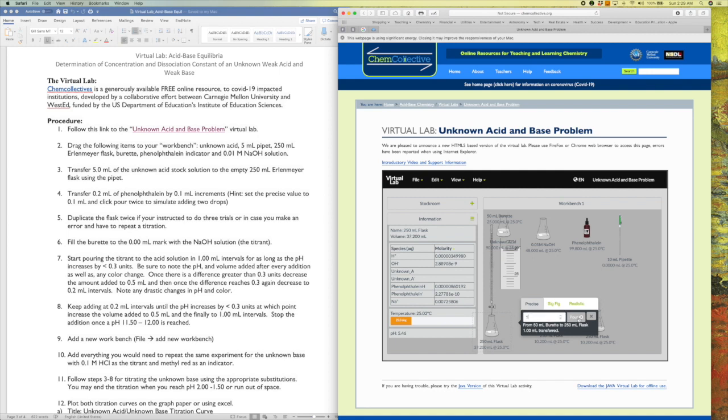Still going up by about 0.05. Okay. We're still going up by 0.05 increments. So, I mean, increments of 0.05. So 1 ml is good.